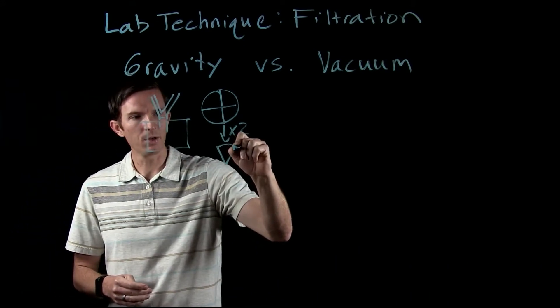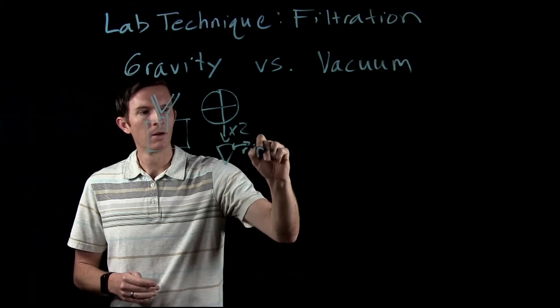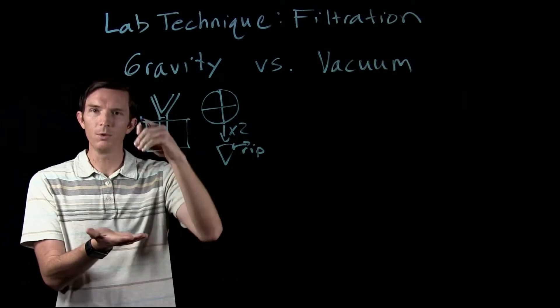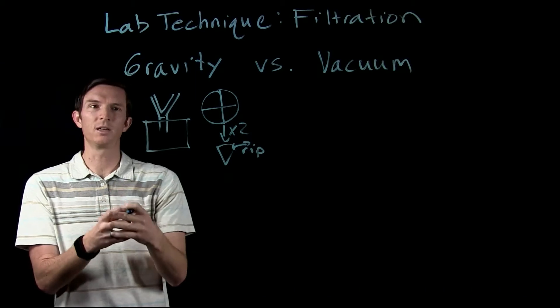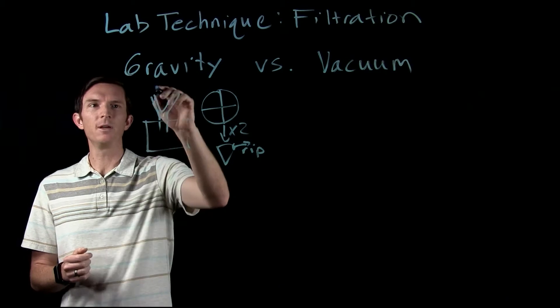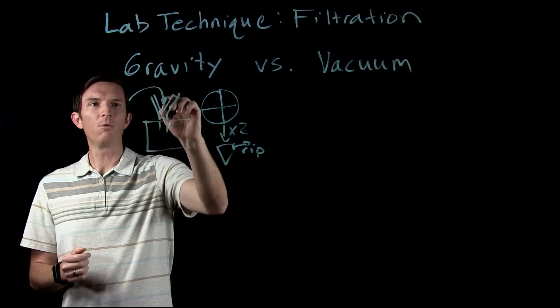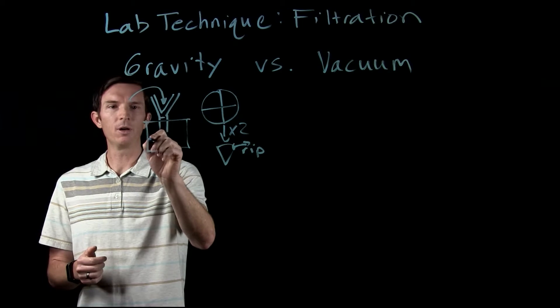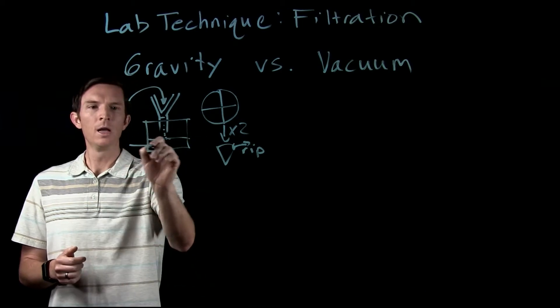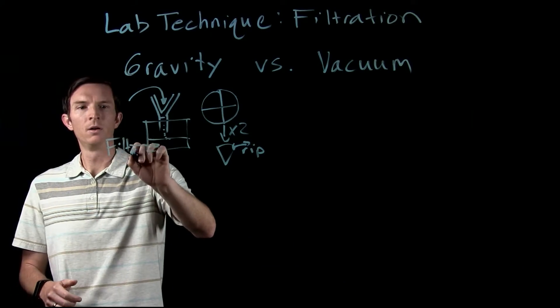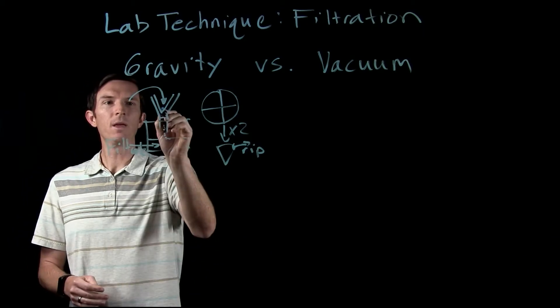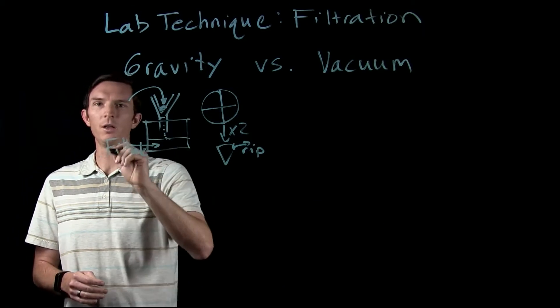Usually what we'll do is rip off a little piece and what that does is that allows our funnel to fit really well when we put our filter paper in there and it sticks. So we now have our funnel here sitting with our filter paper inside of it. Then we'll pour our liquid through there. We'll see the liquid will filter through and we will have our filtrate here. That's what goes through our filter paper, and then we'll have some solid here.